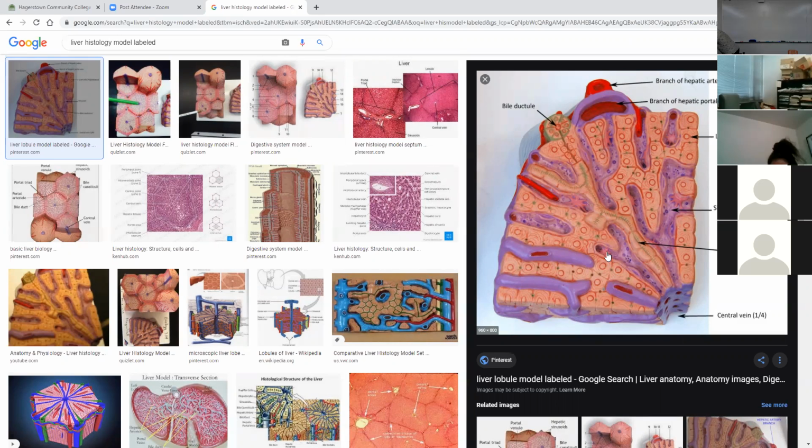And these little spidery things in here, not really labeled, are hepatic macrophages. They're wandering macrophages that wander through sinusoids looking for bacteria or somebody foreign that could have gotten in through your intestine and sent to the liver. So they hunt for it. And so that's another immune function there. All right.